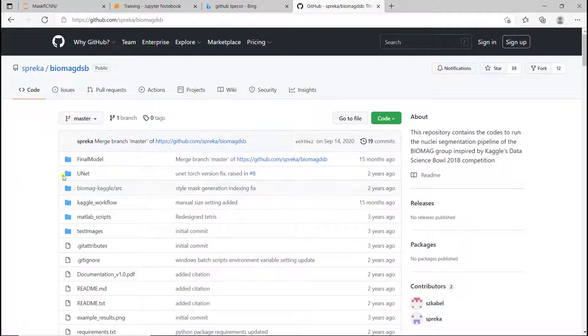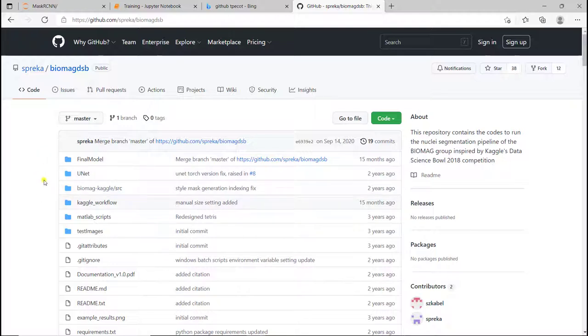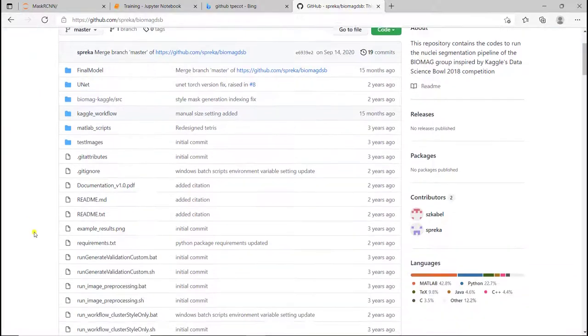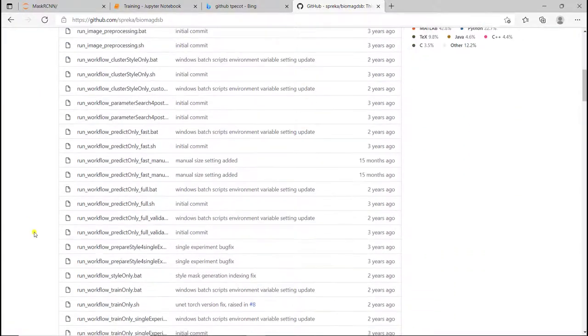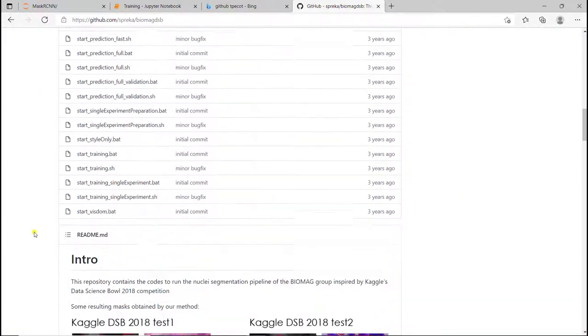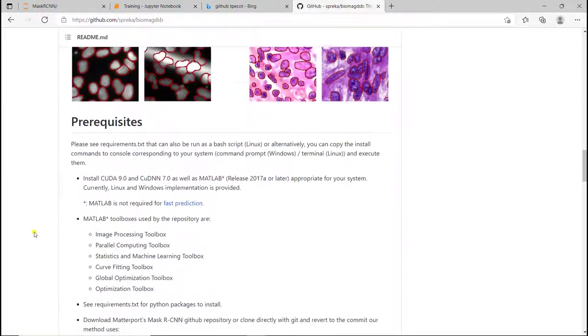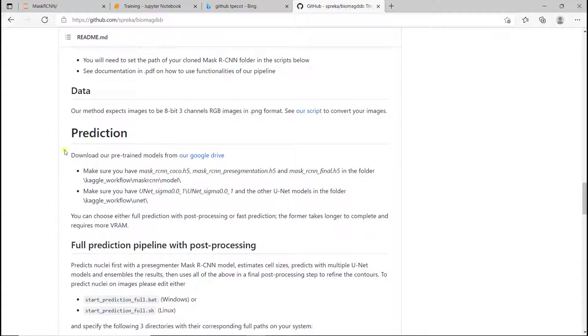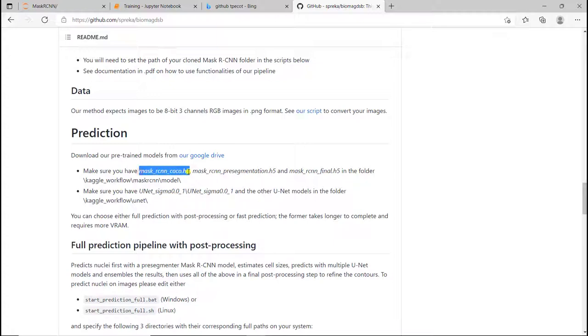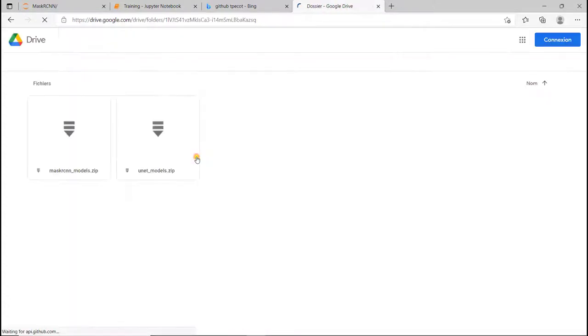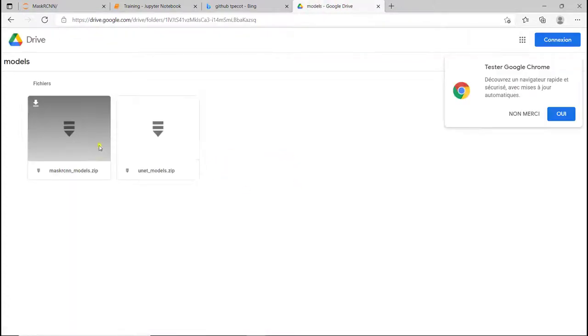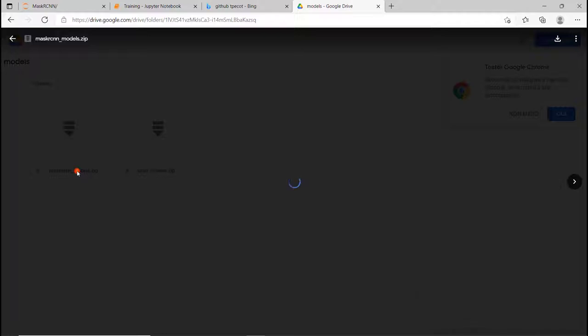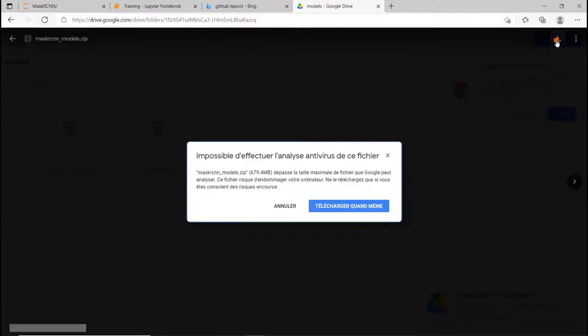It's people that used the Mask R-CNN in a different way for the Kaggle workflow. And on this GitHub, there is a pre-trained model with the COCO dataset. I'm going to scroll down. And here, when you arrive at prediction, here they talk about the pre-trained models. They have the Mask R-CNN COCO, which is available on their Google Drive. I'm going to click on Google Drive and select the Mask R-CNN and then download it.